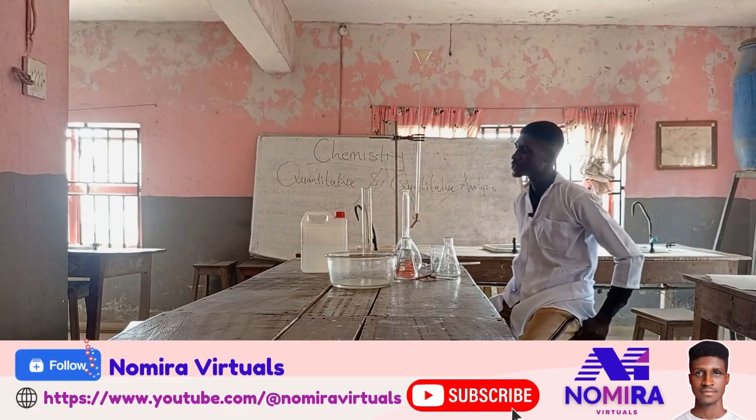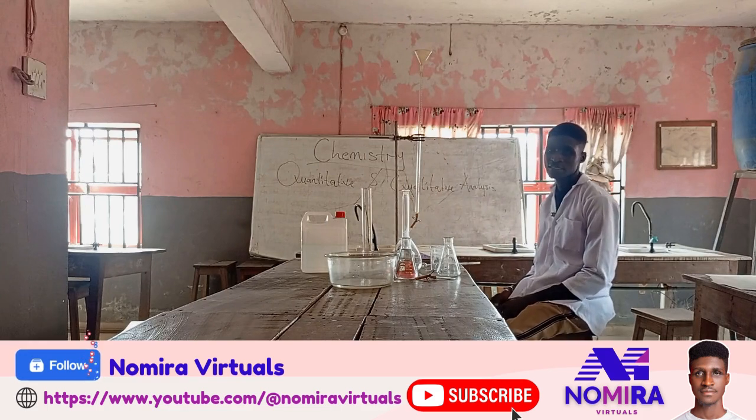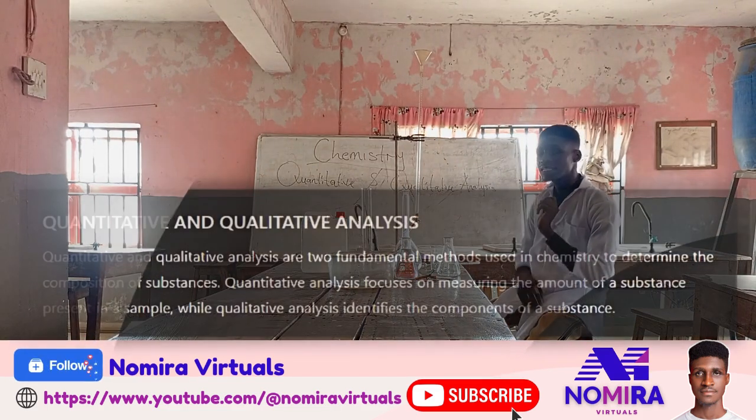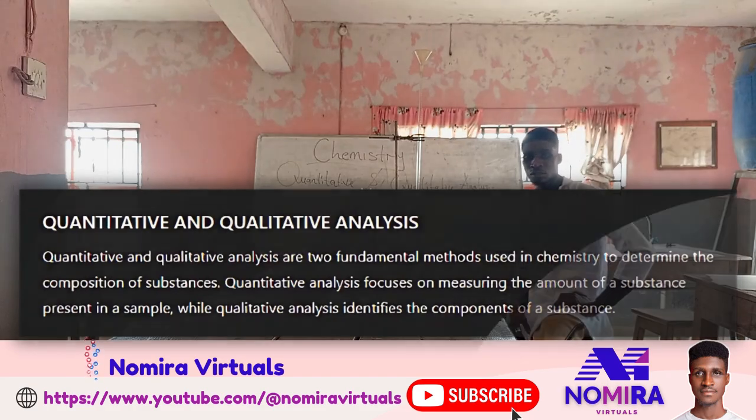Today, I have a simple setup for titration, which is under quantitative analysis. What is quantitative analysis? Quantitative analysis is a method that demonstrates the amount of particles in a substance, while qualitative analysis is a method that demonstrates the presence or absence of this particle in a substance.